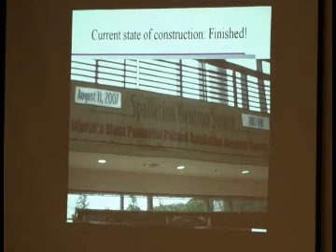What's the goal of this spallation source? 1.4 megawatt. So not only is it already the most powerful source, they are planning to be a heck of a lot more powerful than the other sources that have been built previously. And there are some other countries that are thinking about building new spallation sources, so there will be more competition again in the future. But it will be a very powerful source.